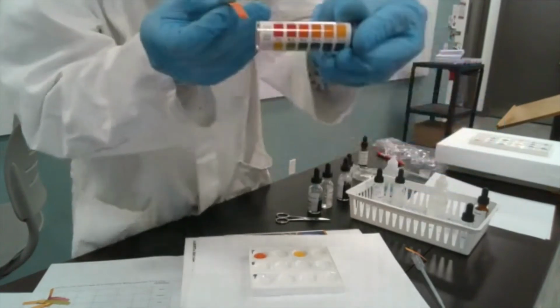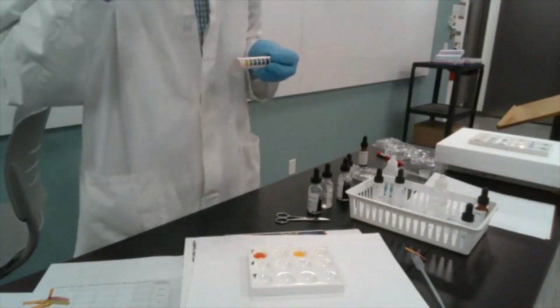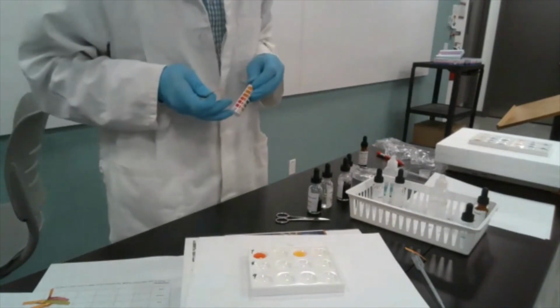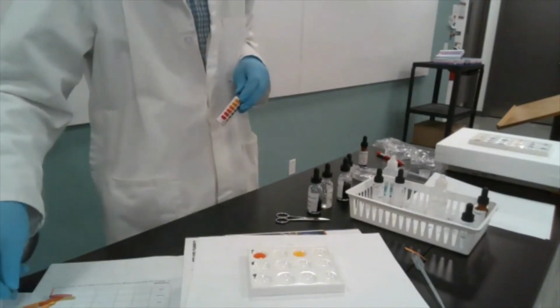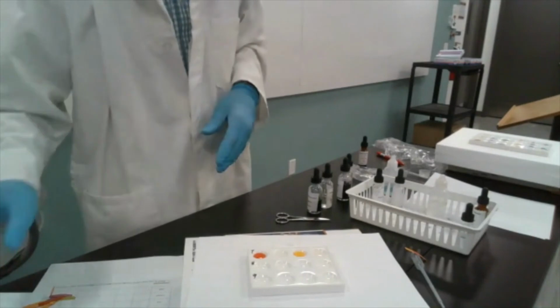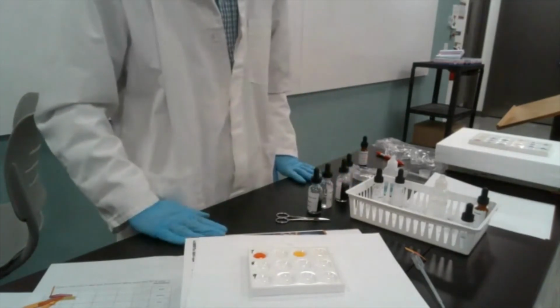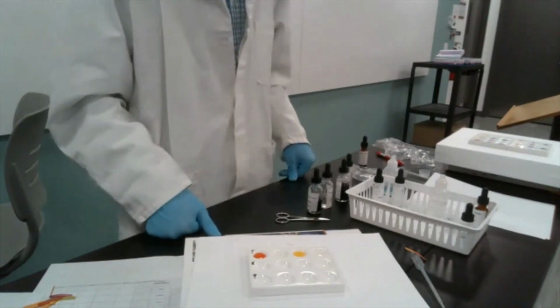3 probably is the closest match, because 4 already is going into orange, and this definitely has some red to it. So I would say this is pH 3. You see that your pop is almost as acidic as your grapefruit juice, right? So also keep that in mind next time you're opening another bottle. Your teeth probably don't like the acidicness of pop just as much as that of grapefruit juice. So it's a relatively acidic substance, as the pH strip tells us.